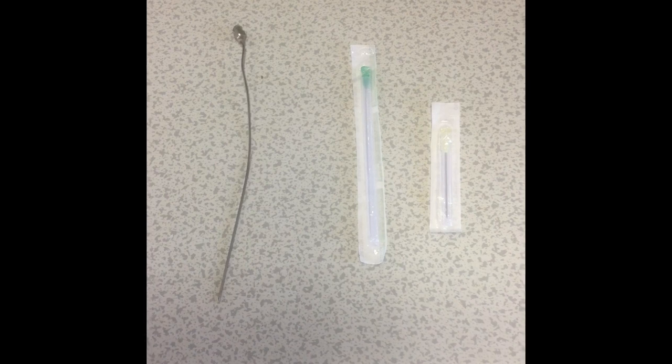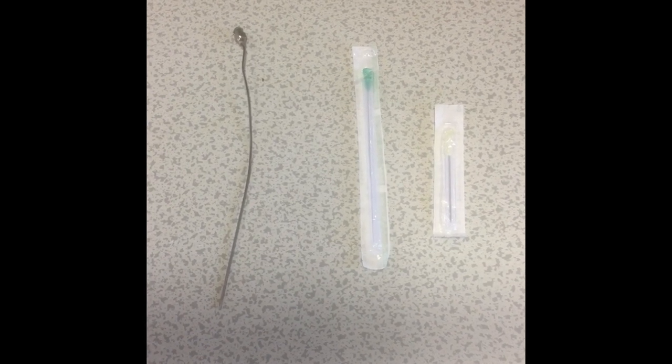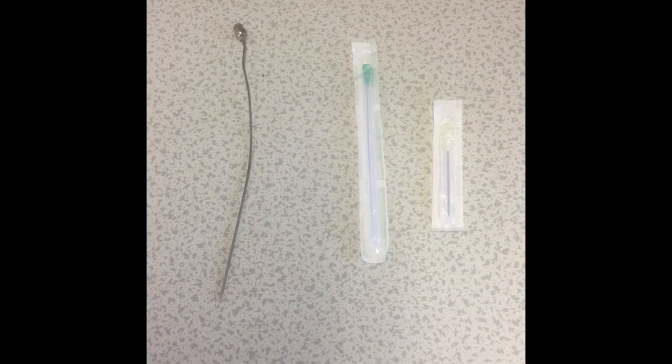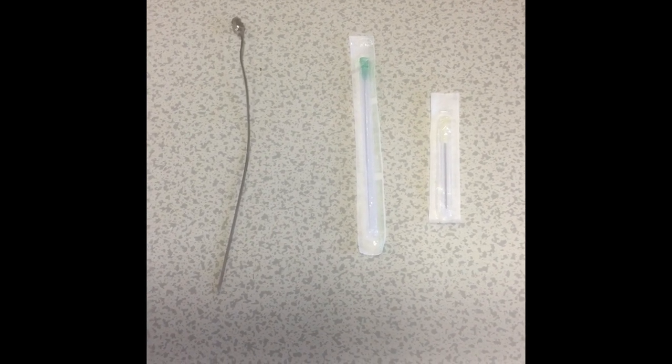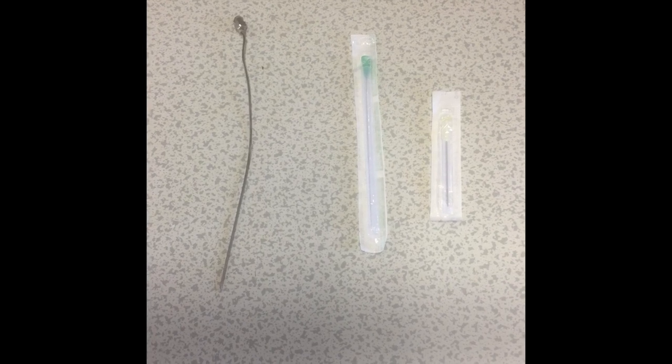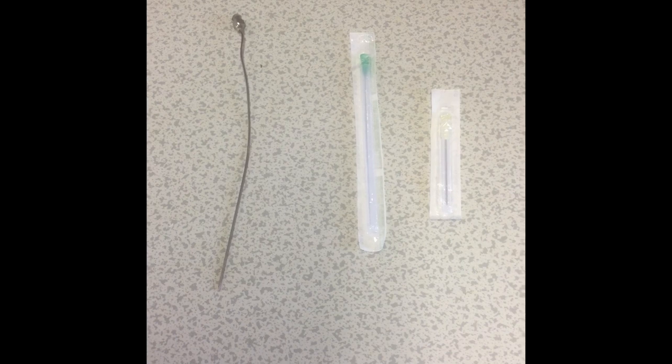Here are some examples of the types of needles used in the teaching laboratory. We have a long metal transfer needle which is reusable, and a couple of the disposable variety which come pre-packed. The reusable needles are returned to stores once they have been cleaned.